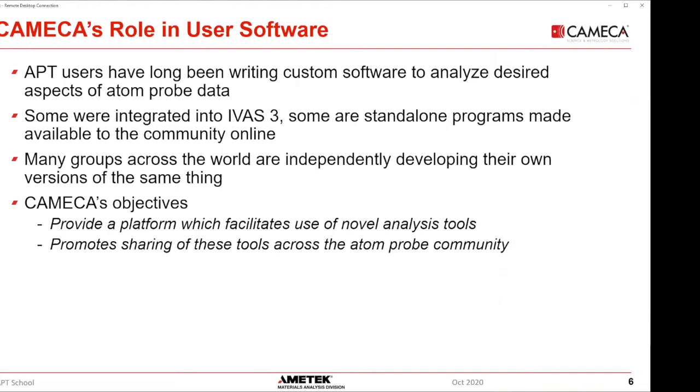making raw atom probe data from a machine, and now with APSuite, visualizing atom probe data and analyses, and then, I don't want to say offloading some of the work, but bringing in some of the work that you as a community have done into our software, so that we can provide more analysis features for the community than we could possibly do ourselves.